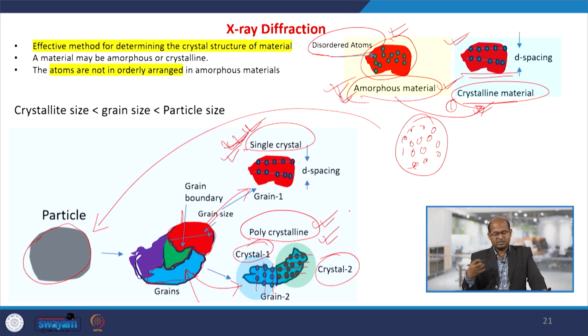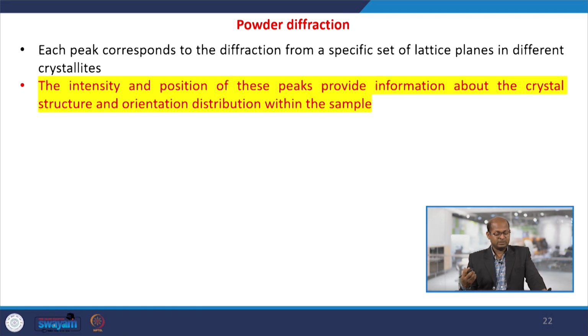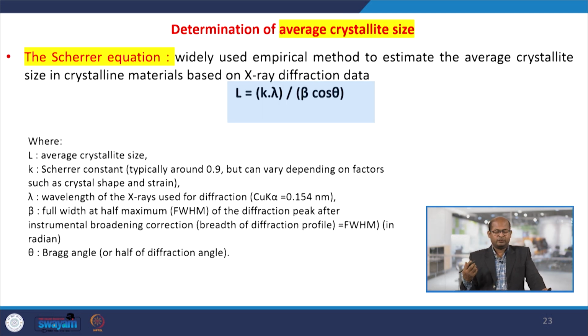Suppose we have a material or catalyst that we have prepared. If we want to know whether it is an amorphous or crystalline material, or whether one particular type of crystal or multiple crystals, a polycrystalline nature, is present, then of course we have to do the X-ray diffraction analysis study. Here, the particular crystallite size can also be found from the XRD pattern.